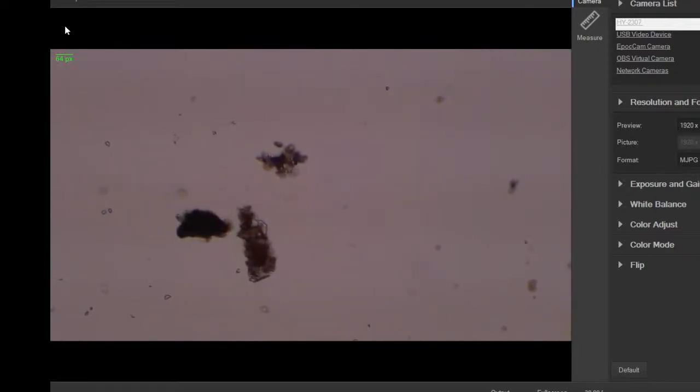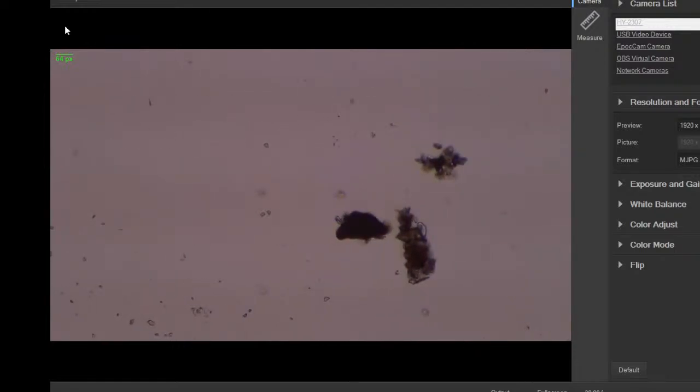It's got crazy movement. I found one of these earlier in the other slide. It was much faster. I couldn't really follow it, but now it's nice to see. It's very thin. You see as it rotates, it's kind of compressed. It's not like a paramecium, which is kind of like one of those cold capsules you take, or some vitamin pills that have that kind of round capsule. A lot of thickness. These guys are pretty thin, but still pretty long. And crazy spinners.